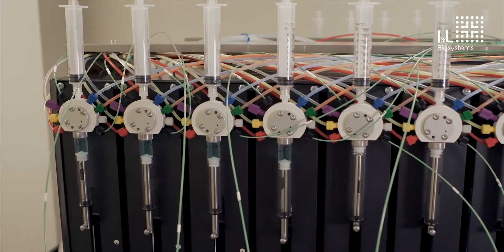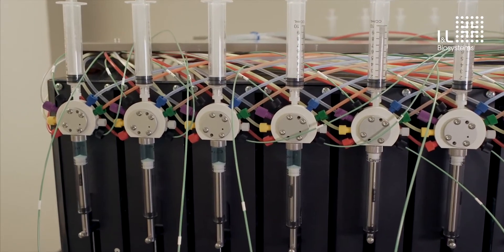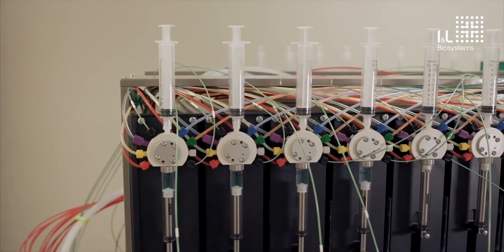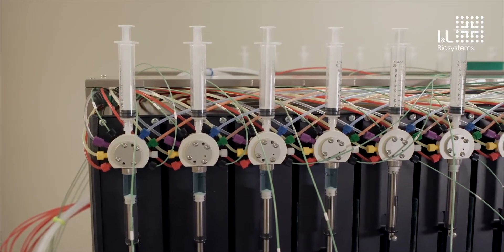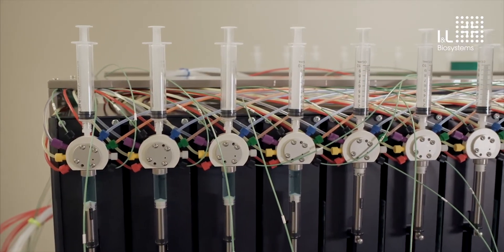12 pumps are here on the front of the machine, and there are another 12 pumps in back. Having 24 individual pumps enables all 24 samples to be purified simultaneously.